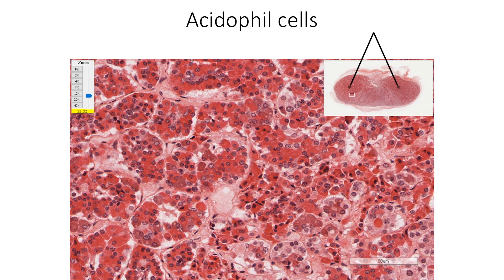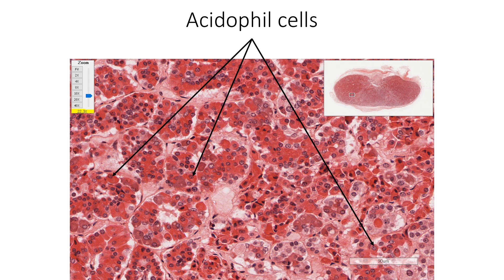Acidophils occupy predominantly the lateral wings of pars distalis. Two types of cells make up the acidophils: somatotrophs, secreting growth hormone, and mammotrophs, secreting prolactin. These two types of cells cannot be distinguished in routine H&E stained sections.